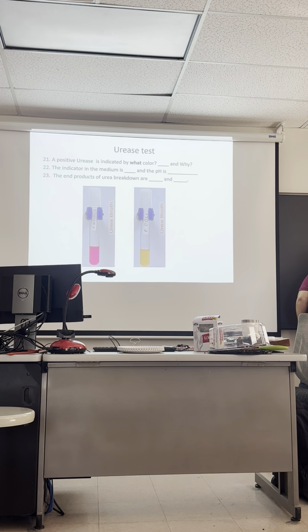Phenol red is yellow, and when it's yellow, it's acidic. When it's orange or red, it's neutral.